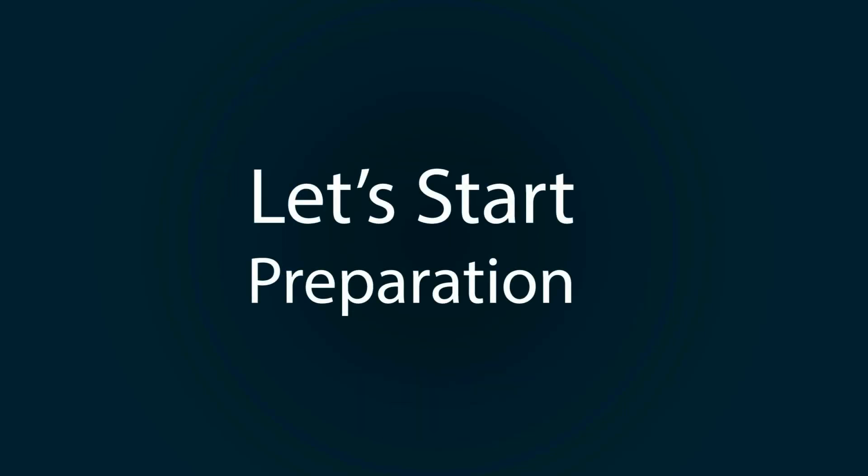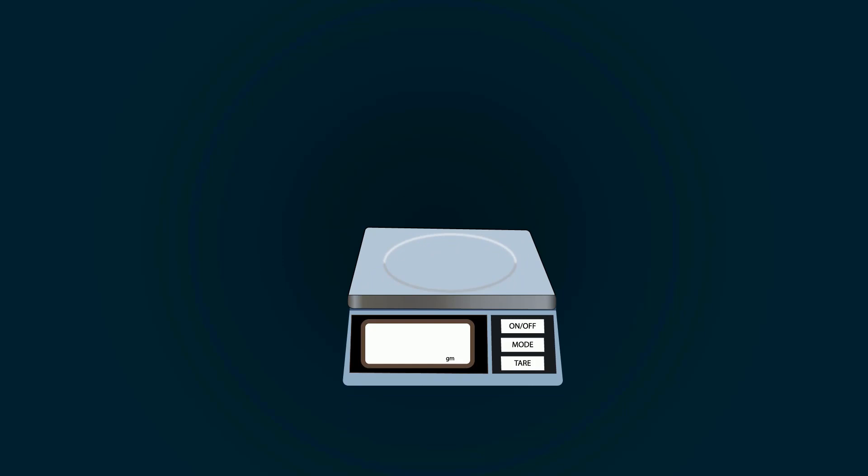Let's start preparation. First of all take the weight balance and power it on. Now put a petri dish on it. Don't forget to tare it down.